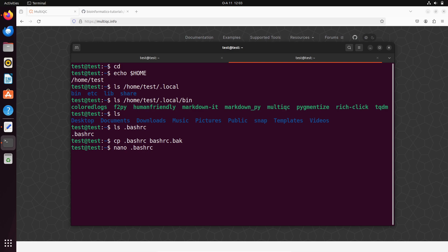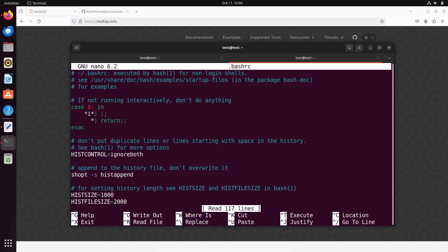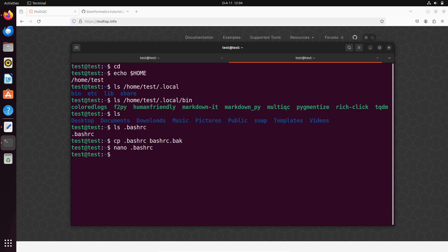Now we can edit the '.bashrc' file. Type 'nano .bashrc'. Instead of nano you can also use vi or vim or any other text editor — it's a matter of preference — but I prefer nano because it's straightforward. So let's open 'nano .bashrc'.